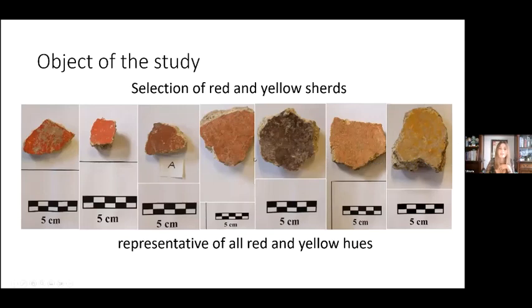The analytical survey had indeed the purpose of providing historians with the useful information to attempt to fill this archaeological gap. The analyzed wall pieces were selected with the aid of archaeologists and involved seven painted shards that, having undergone a naked eye examination, seemed to cover the whole range of the available reddish-yellowish hues, namely bright red, red, pinkish red, purple, orange, and yellow.